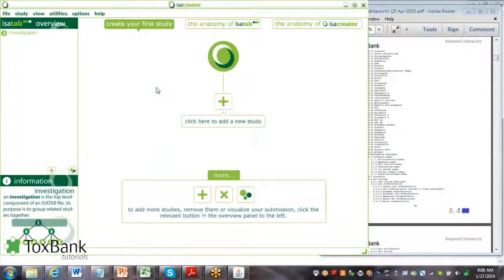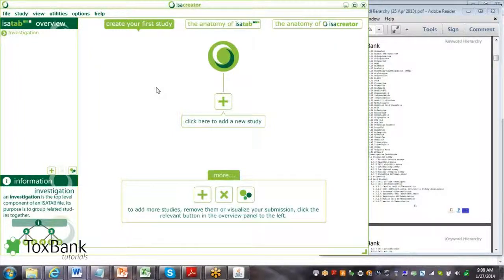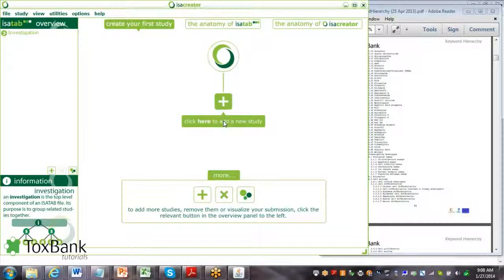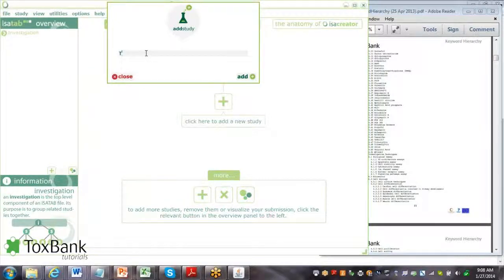An investigation is a collection of studies. It's generally the entire experiment that's being performed. There needs to be at least one study in the investigation. I'll just go ahead and add a single study and give it a name.